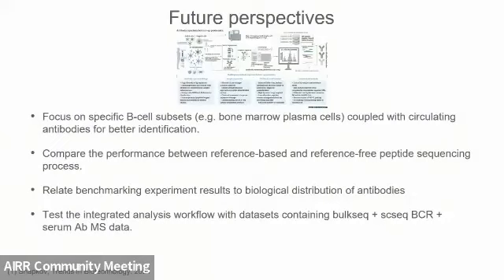And we also want to compare the performance of mass spec, reconstructing the peptide sequence with the reference and without the reference. And we want to relate the result of our benchmarking experiment to the biological distribution of antibodies. And finally, we want to test this integrated data analysis workflow with data sets that have the sequence from bulk seq, single cell BCR seq, and preferably with mass spec data as well.